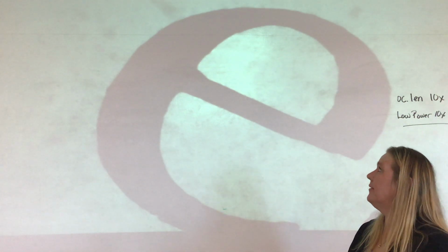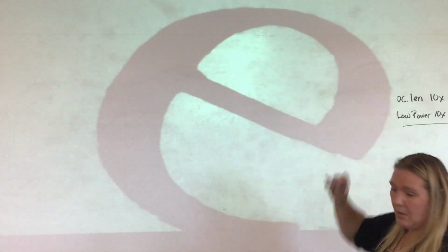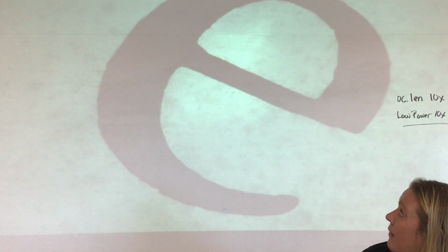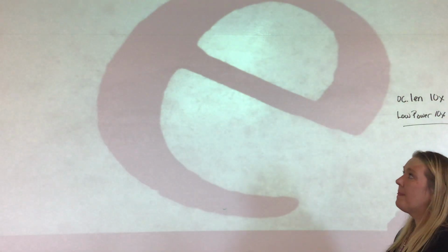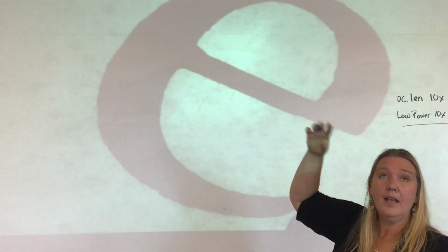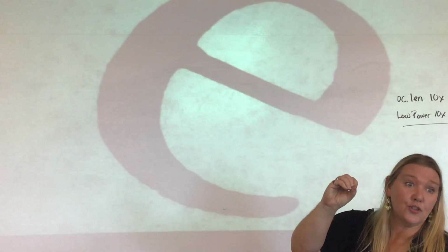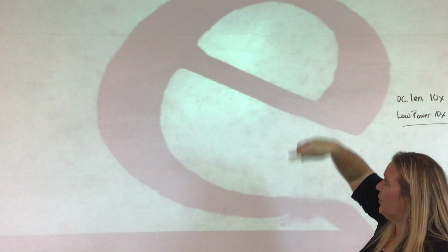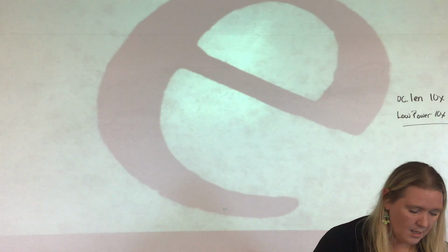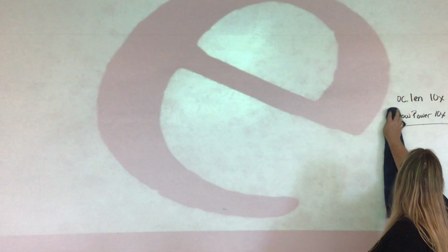So draw that. Inside of your circle on your lab, draw the E almost touching top and bottom, or touching top and bottom. Our screen looks square because it goes through a projector, and that projector ends up being a rectangle. And then you have a circle to draw. So just make that a circle and then draw that E. It takes up almost the whole space. So while you're doing that, I'm going to erase this part.